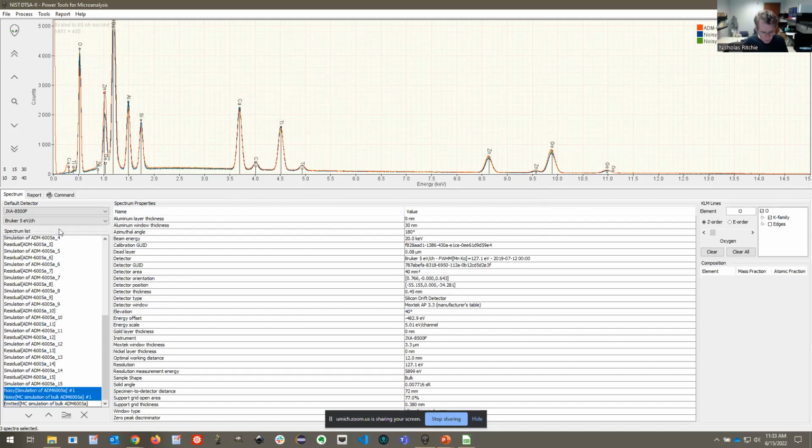One of the nice things about Monte Carlo simulation is that you can quantify the simulated spectra. I'm going to skip the details, but I could simulate all the standards and go through the whole process. This is often useful if you want to investigate odd geometries, how an inclusion will affect things, or even the effect of, let's say, secondary fluorescence.